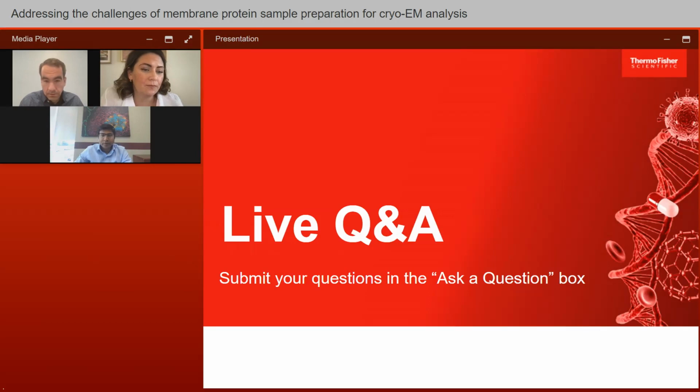Great. There are a ton of questions here. I think a follow-up question to something you mentioned before, Rosie, about multiple membrane proteins in one nanodisc: how do you know if your nanodisc has two or three membrane proteins, and how does it affect what you see in cryo-EM in terms of resolution of particles?